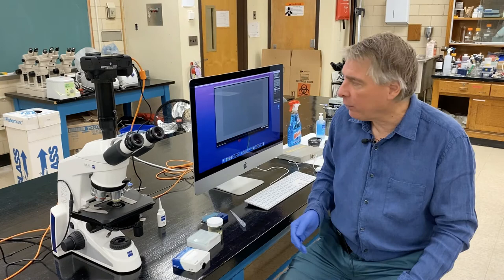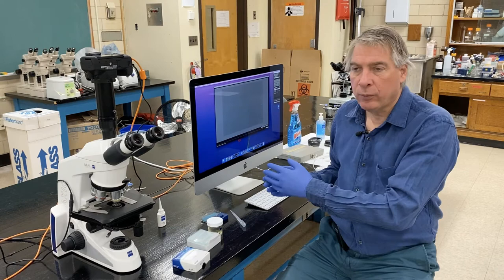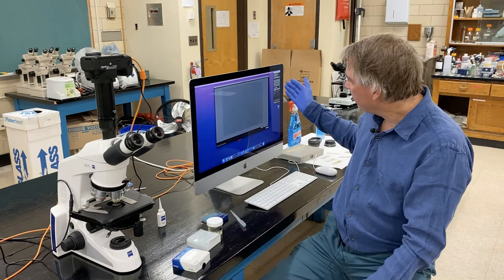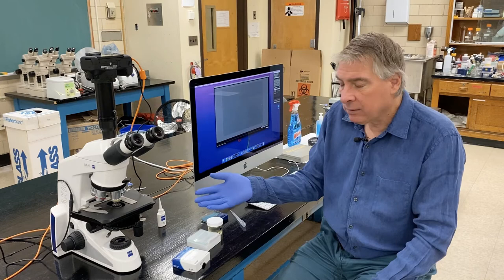I loaded the SD card into the camera. I turned the camera on, and I got the camera to communicate with the computer through EOS Utility 2. And I have my control panel up and remote live view window is now open. I made sure that the microscope was aligned in Köhler illumination as we looked at the other day.